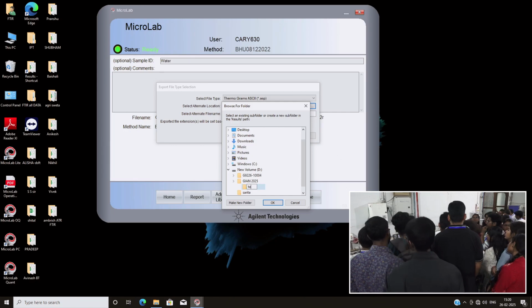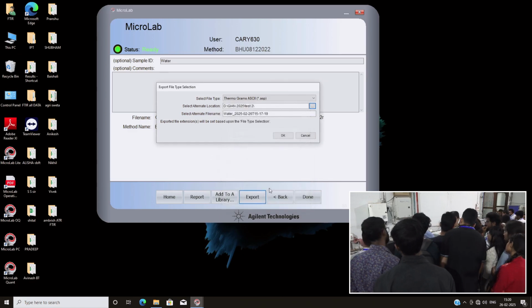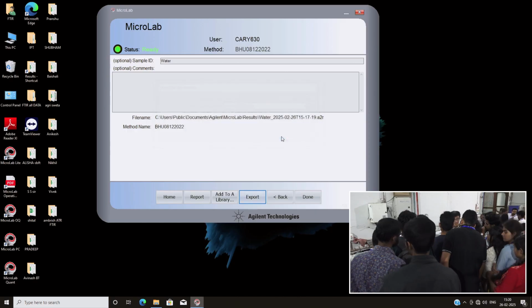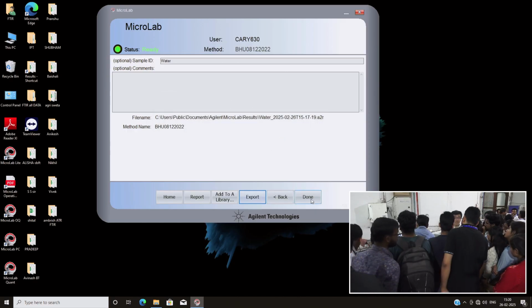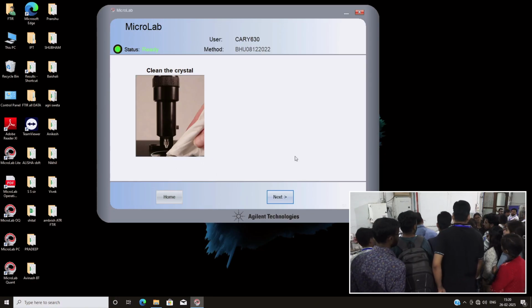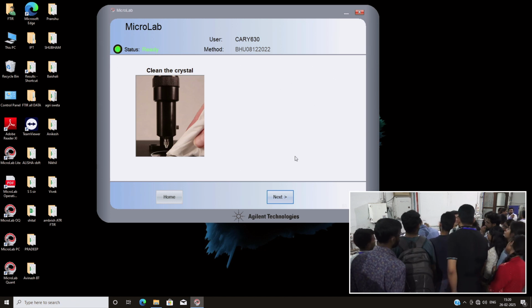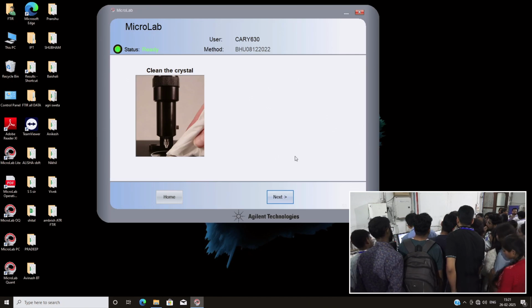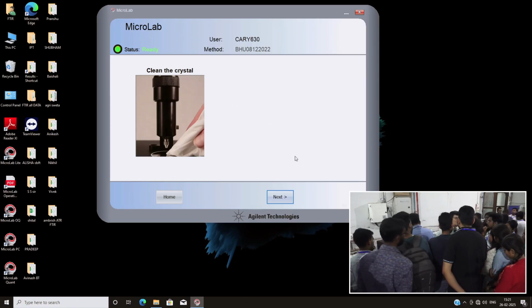So I think that peak is observed, but due to some transmittance problem of the prism, some small feature. Is there any effect of air particles? Air particle? No. Actually, during the IR measurement in the transmission configuration, don't talk. The vapor from my mouth affects the result, and the vapor peak increases.